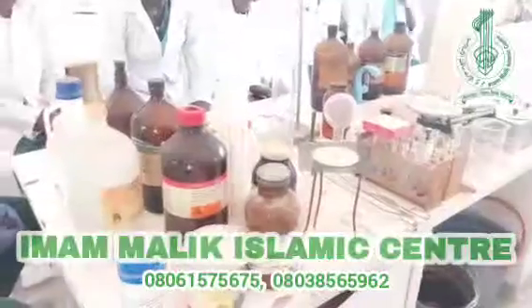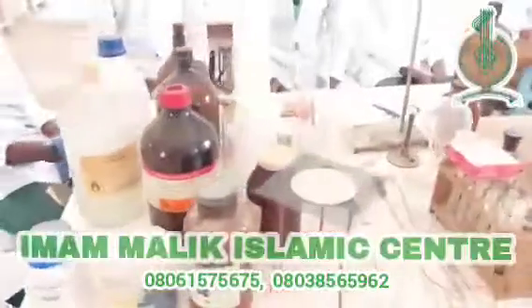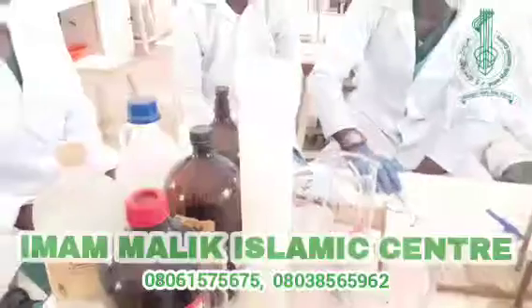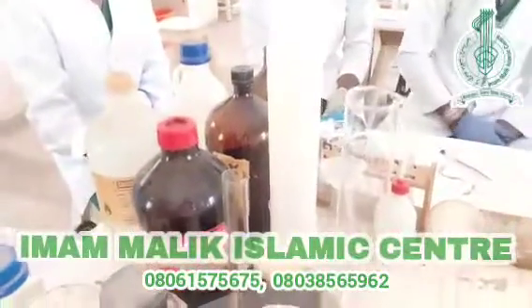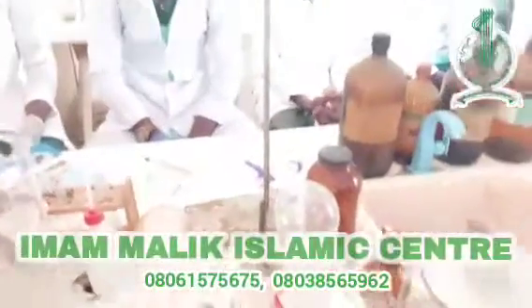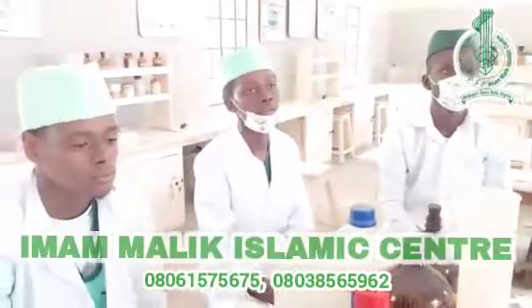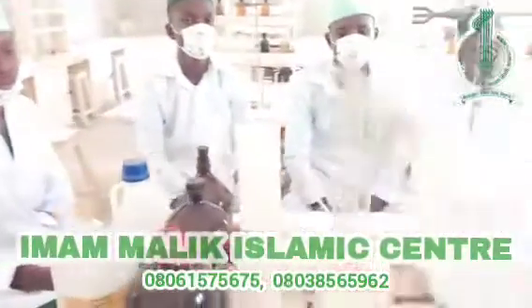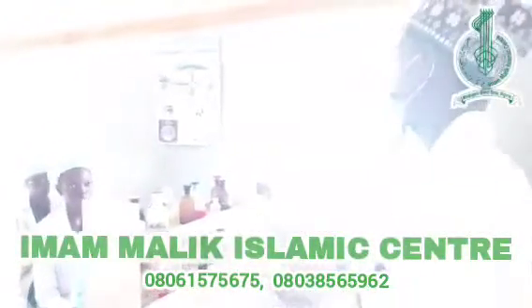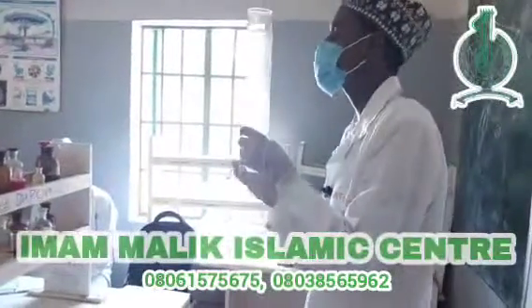Among the main functions of all these equipments, there are plenty of lab equipments used in the chemistry lab. Some are designed for single function. We are going to see examples, like the graduated vessels or cylinders. They are only used for measuring. You cannot say, I'm going to use this for mixing of chemicals or so. No. You only use this for measurement.